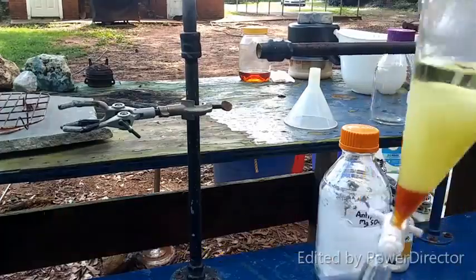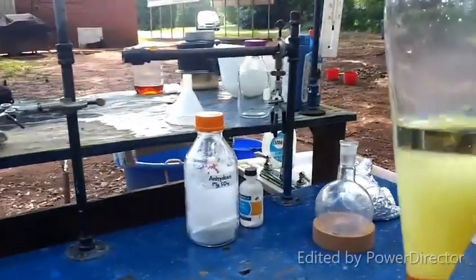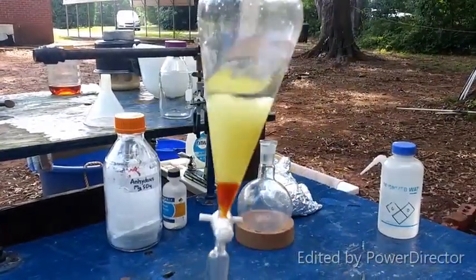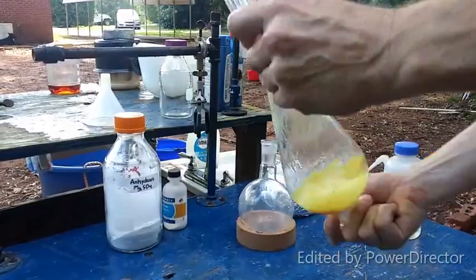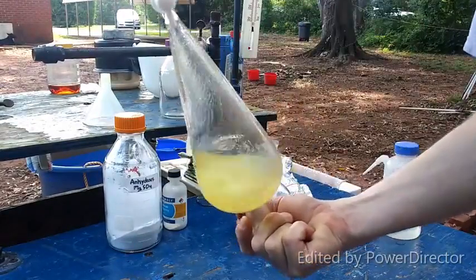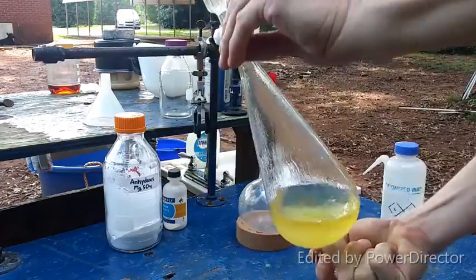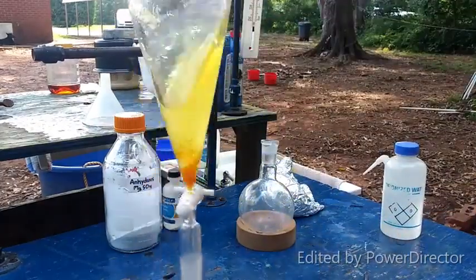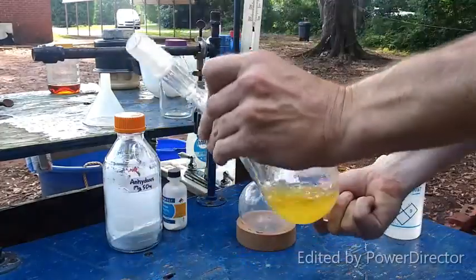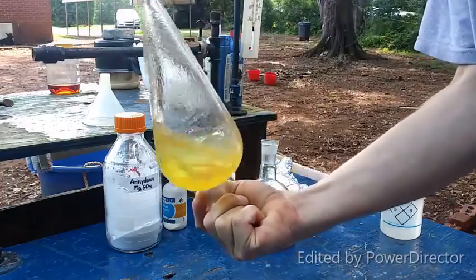Alright, so now we're going to do the usual deal here. Let me move you guys back so y'all can see this. Alright, so we're going to invert and swirl. And our diiodomethane will dissolve into the ether layer. And I really, really hope that that's enough ether.